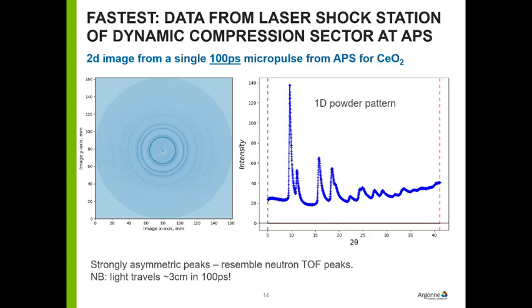Well, there's a mode of operation for APS in which they can take all those electrons and put them into a single bunch. And they call that single bunch mode. The object here is that you have this single bunch of electrons going around, and it generates a big pulse of X-rays. Well, there's a beamline in which they want to do this experiment so that the X-rays arrive at the sample the same time a laser, a high-power laser, hits the sample, basically blows it apart.